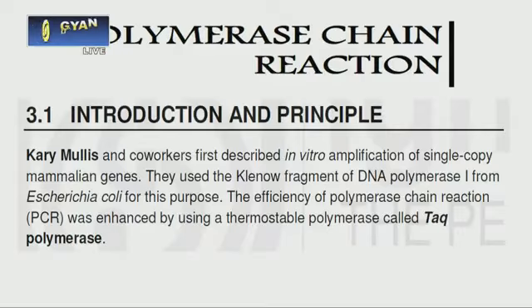The enzyme which is used for undergoing a PCR reaction is known as Taq polymerase. Taq stands for Thermus aquaticus. This is one of the thermophilic bacteria from where the enzyme was first isolated. That is Taq polymerase. It is a heat resistant DNA polymerase which is used for DNA amplification. Now, what is the basic principle of PCR?